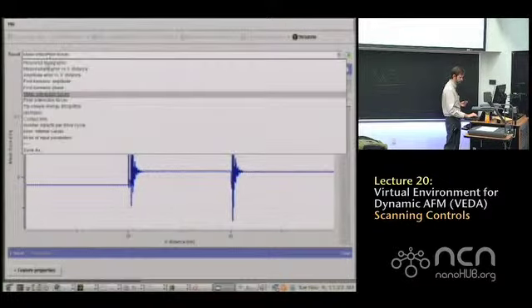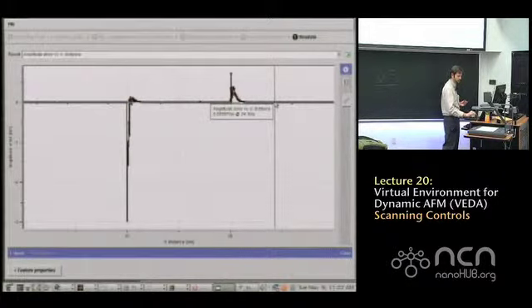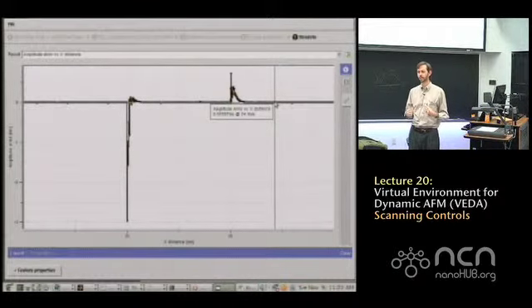And you'll see that actually, as far as the controller is concerned, it's reached a 0 error. Yes. The error map is 0. So the controller thinks that it's doing its job because the error is 0. But there's 2 different z locations where you can have a 0 error. So it just so happens you got the wrong one.